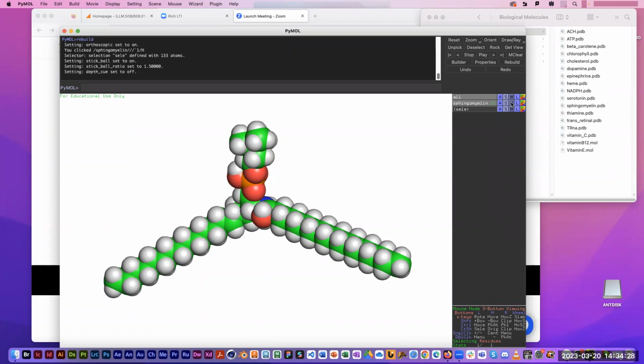Well, let's see what else. So again, hide just lets you hide all of the things that you can show under the show menu. There's an L here for labels. I don't ever bother with labels. If I'm going to put labels on a molecule, I'll add those labels separately in Illustrator. I don't do it in here. The final button here is the C, which you might be able to tell from the rainbow. That's the color menu.